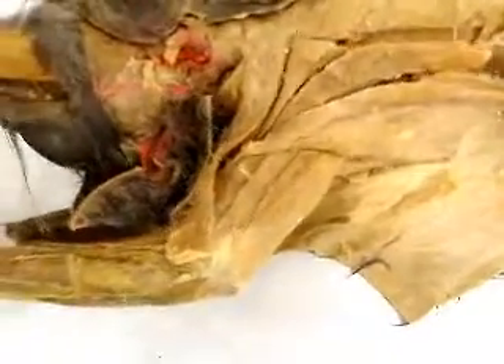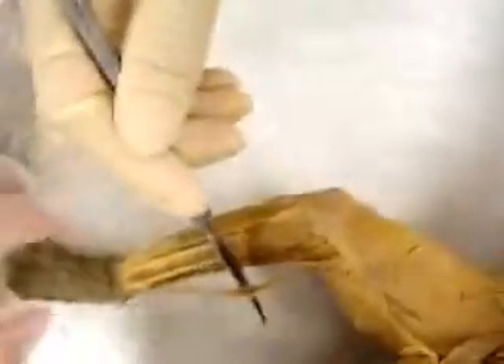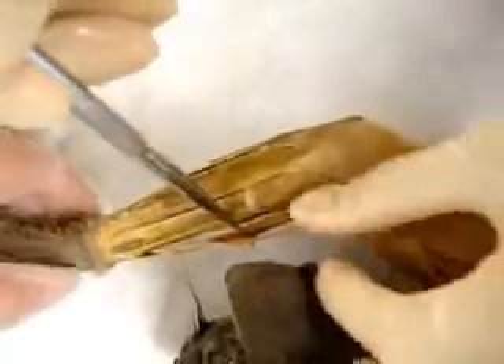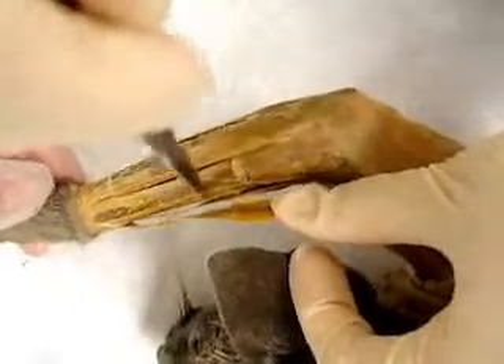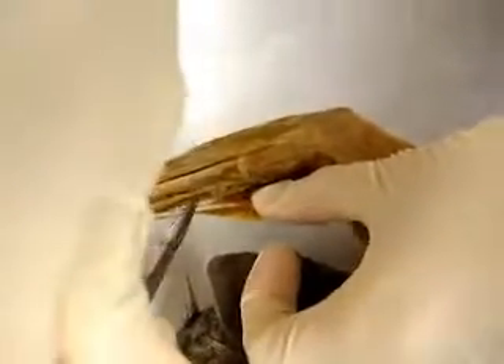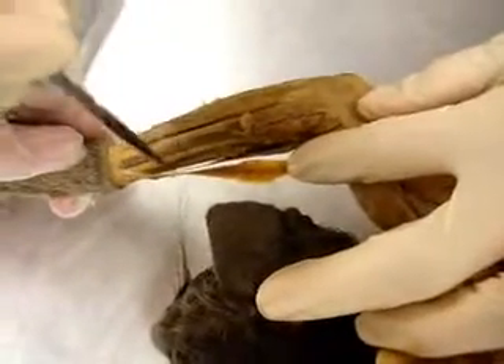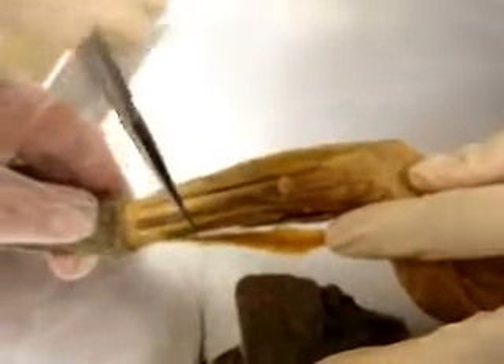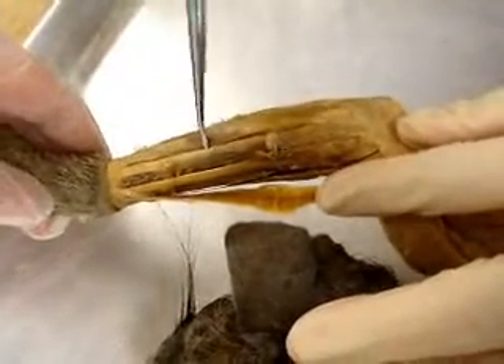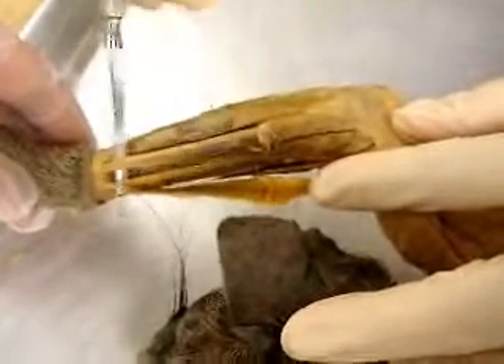Moving on to the forearm: here's brachioradialis, and the next muscle right here is the extensor carpi radialis longus. Next is extensor carpi radialis brevis, then extensor digitorum communis, and extensor digitorum lateralis.